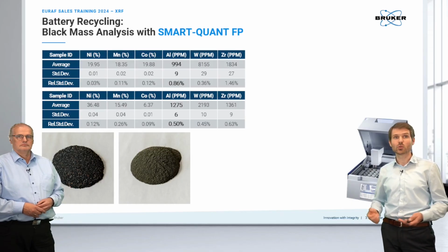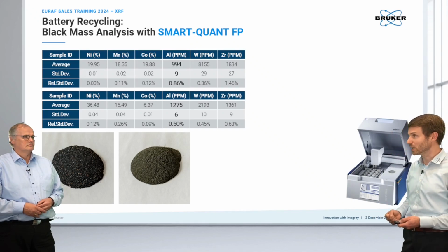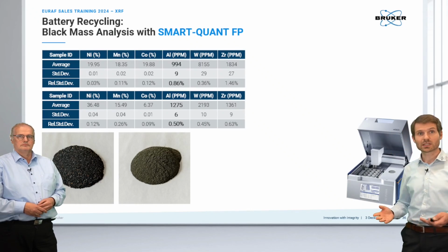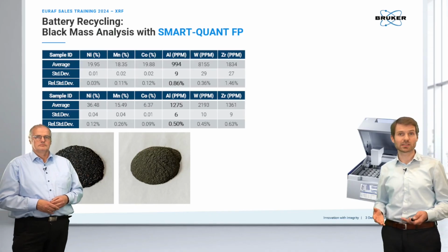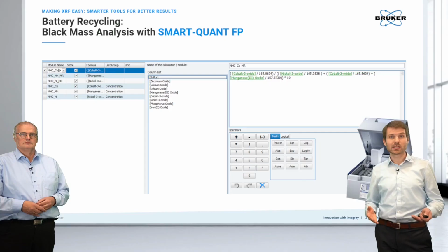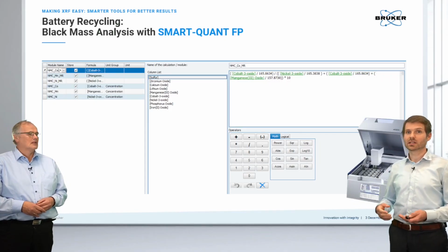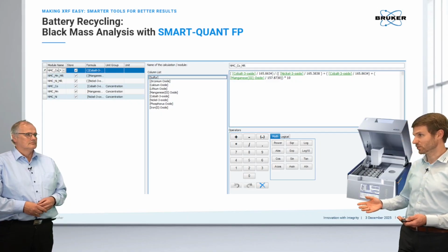So this is something which modern instruments with state-of-the-art fundamental parameters concept can do, and can do pretty precisely and easily.